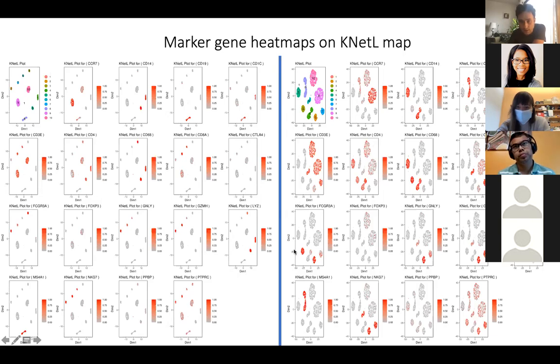Again, if you turn on FCGR3A or CD16 to distinguish between your myeloid lineage, you see FCGR3A comes highest in here. It's also coming high in natural killer cells, but among the myeloid lineage, it comes up here. And if you turn on CD14, these 2 are coming as CD14 positive monocytes. So this one in the middle and down here would be CD16 positive monocyte.